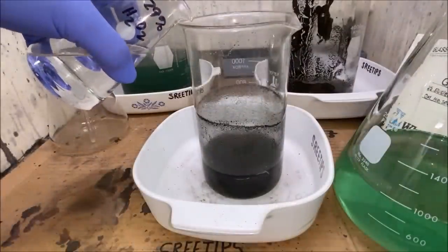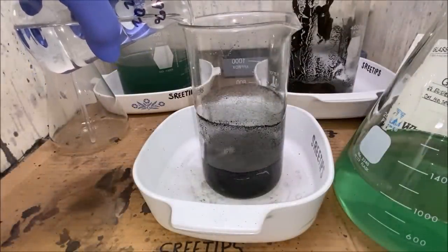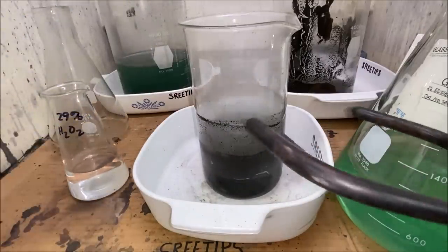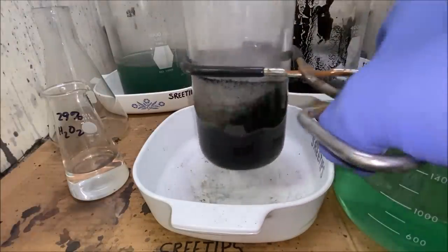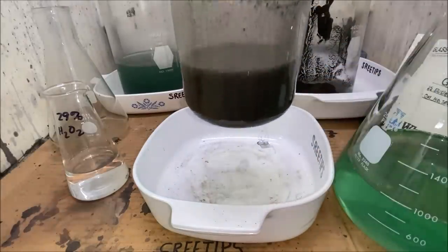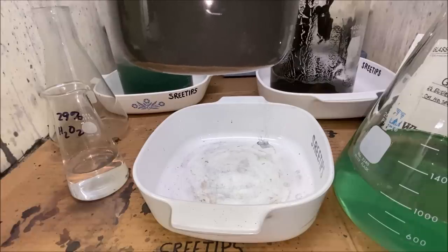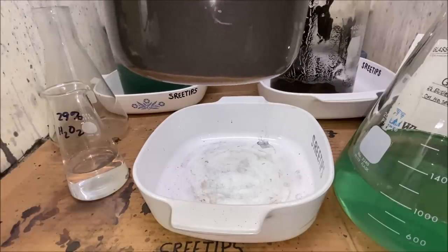Okay, what I've been doing is I'm just adding this hydrogen peroxide, letting it react, and then down on the bottom of the beaker, I notice there's a small little layer of gold that forms down there that looks kind of clean. Little brown layer of gold down there. See that? That's kind of how I'm judging when this piranha solution reaction is complete.